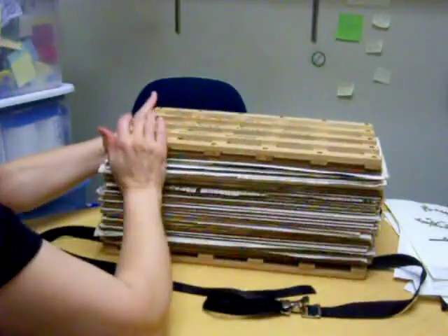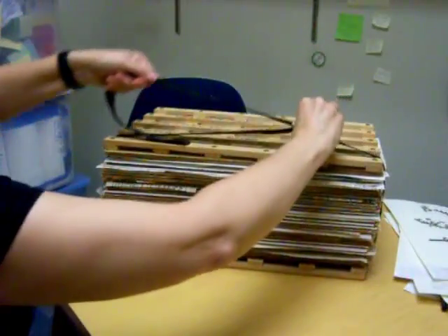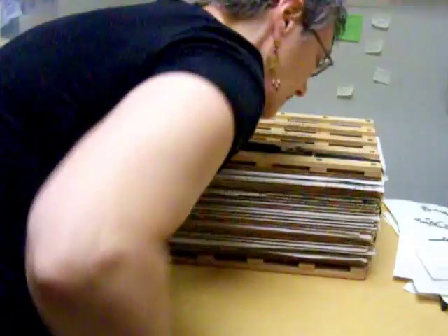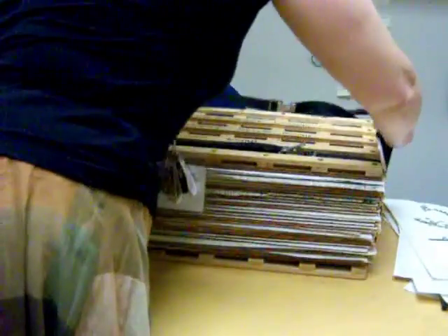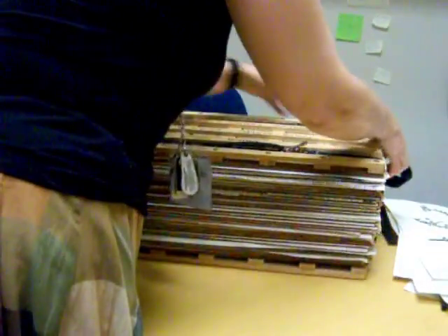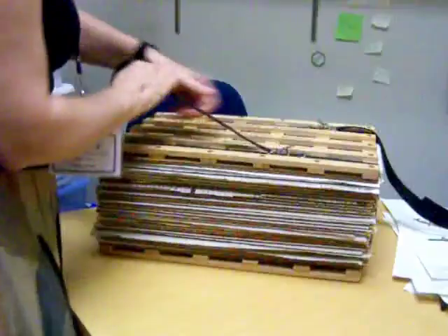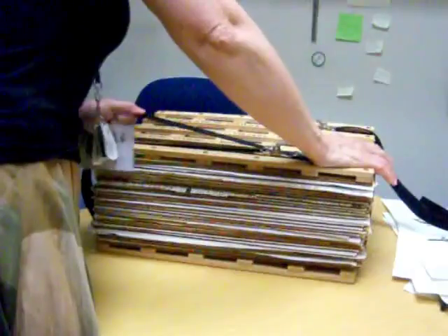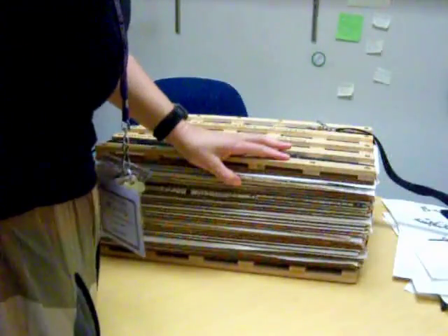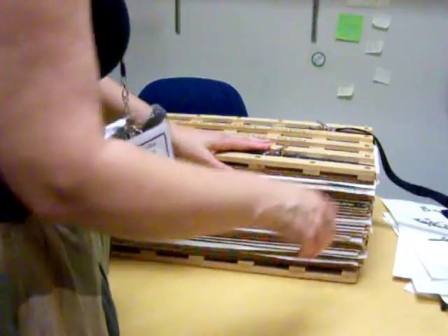Then you want to carefully square everything up. Put the first strap on and just snug it a little bit, then put the second strap on. Pull these as tight as you can. As the plants dry these will loosen, so you want to come back in and tighten them probably every day. It should take about a week unless it's very humid, and then you should have pressed plants that you can mount.